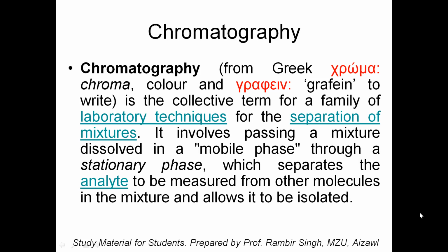So in the process of development of a marker compound, first we need to isolate that marker and then we need to characterize it. We have methods of isolation and we have methods of characterization. Now for methods of characterization, what do you mean by characterization first?